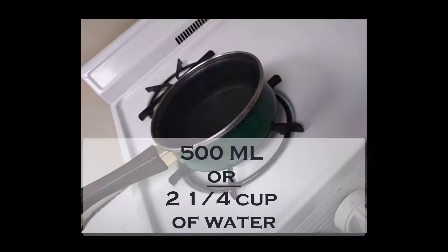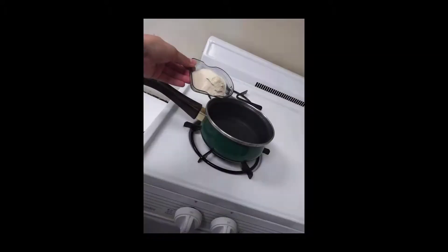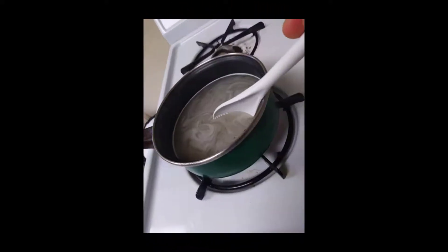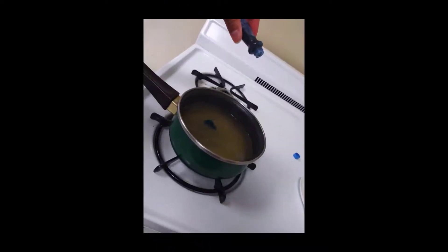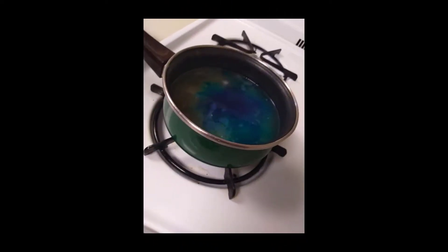Take 500 milliliters or two and a fourth cups of water and add it to your saucepan. Add 10 grams of agar powder — you can use any sugarless agar powder. Next, add 5 to 10 grams of malt extract, light malt extract, or instant potato flakes. If you're using instant potato flakes, use the whole 10 grams. Add six drops of blue food coloring so you can see your mycelium growth easier. Bring the mixture to a simmer and make sure there are no clumps.